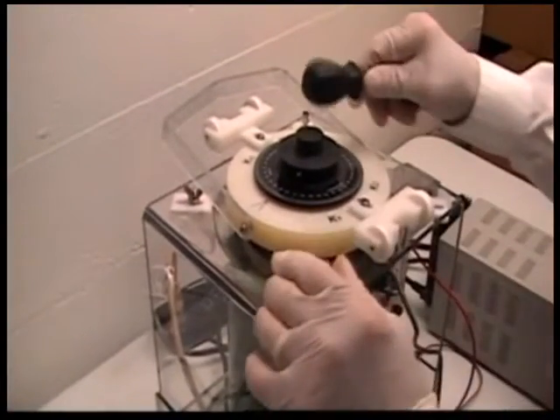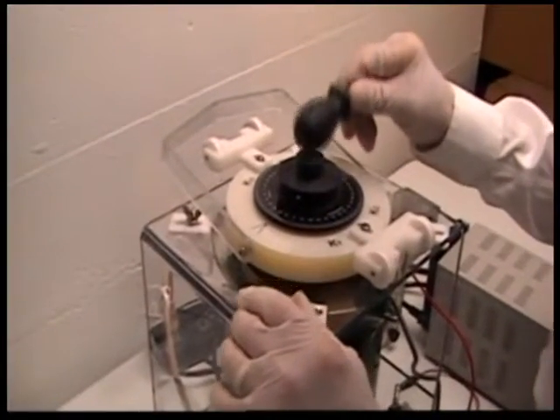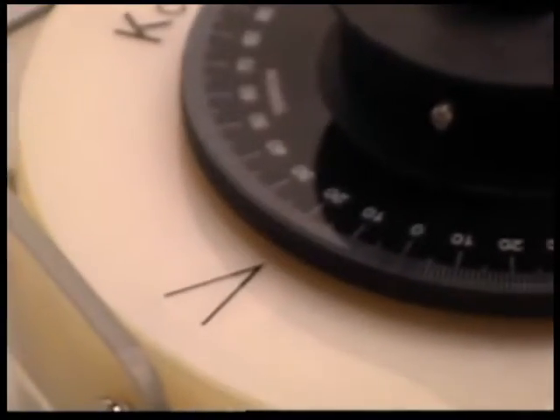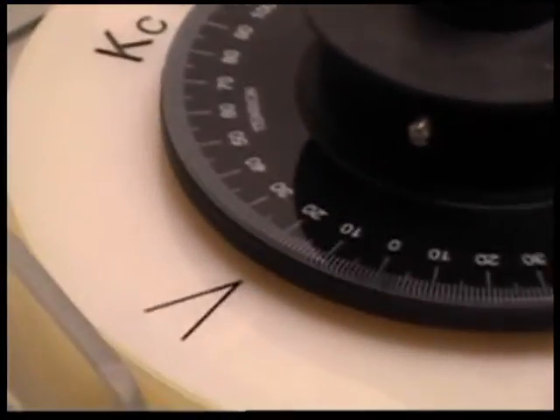At this point I'm going to tap the top of the spiral contractometer to stabilize the reading, then take that reading. I'm getting a reading of 24 tension degrees. That will be recorded, because we'll need that number to calculate the deposit stress.